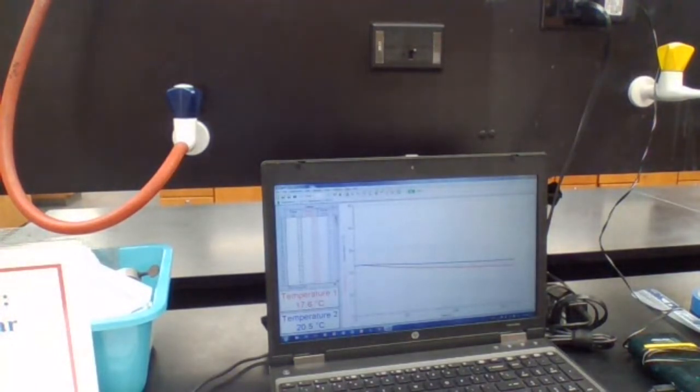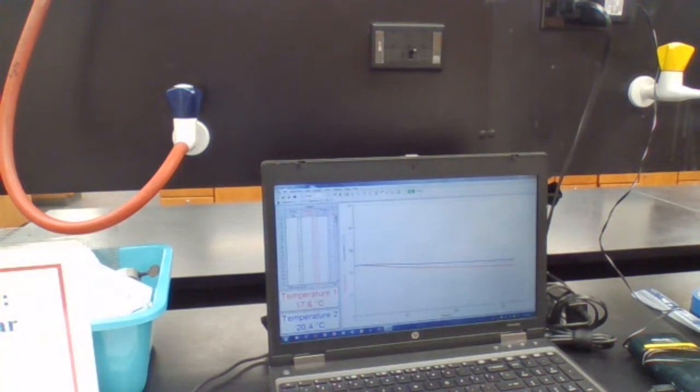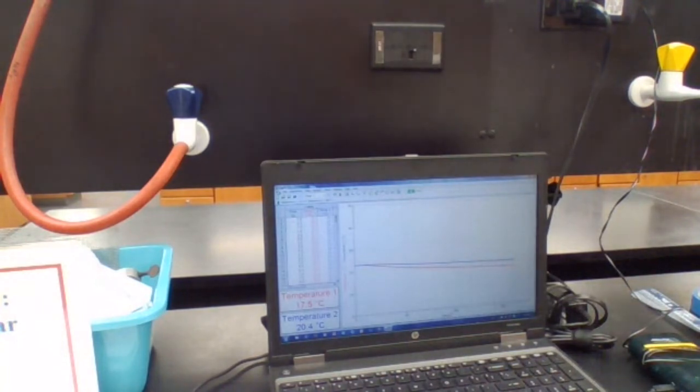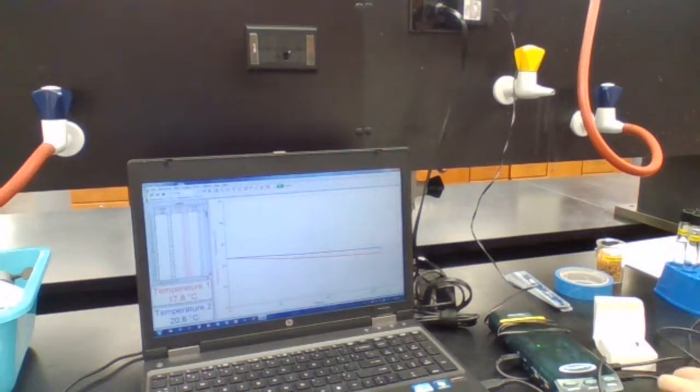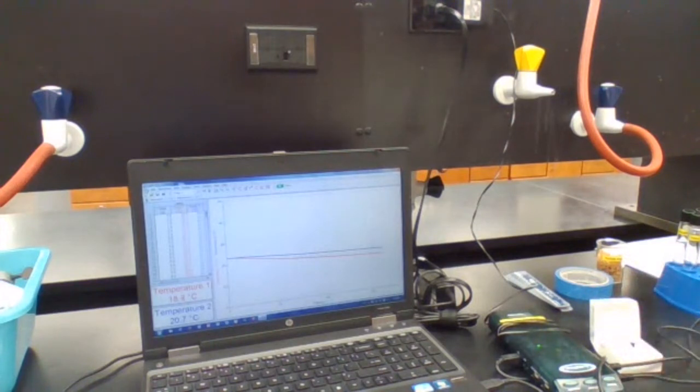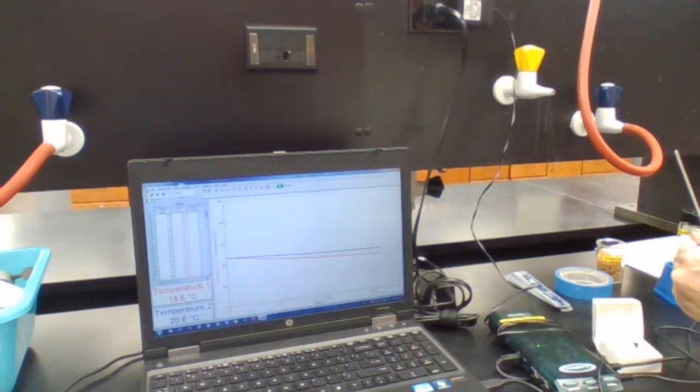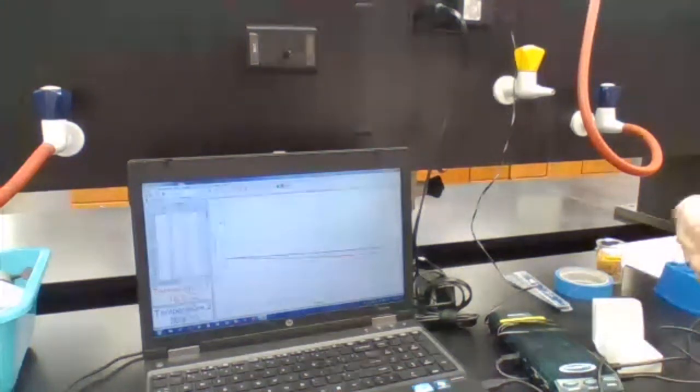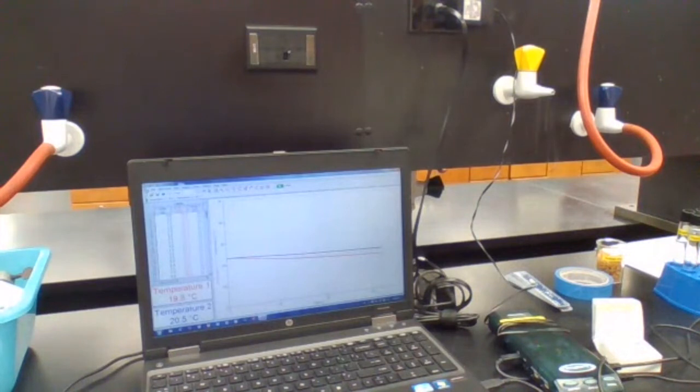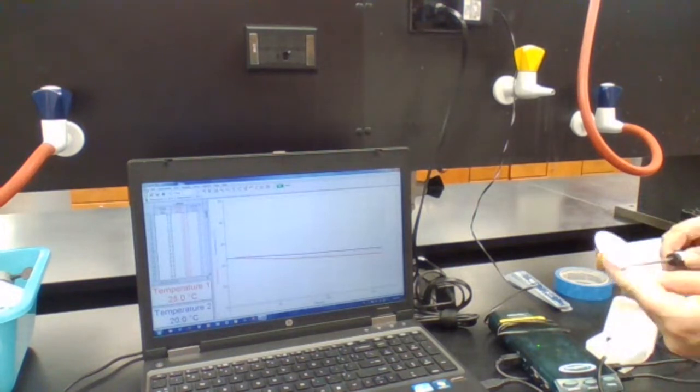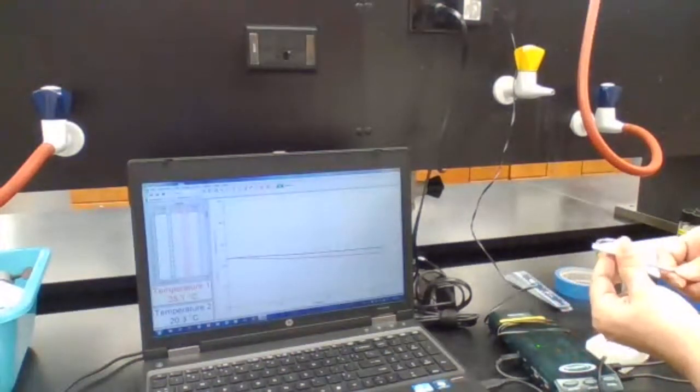Now I'm going to clean up these and set up new sets. The new set is for the last two chemicals that we have. For channel one, I'm going to use pentane for channel one, so I'm preparing the new set. The second one is going to be for hexane.